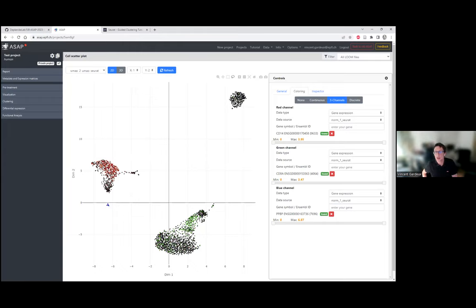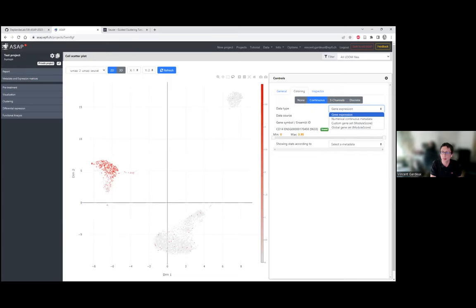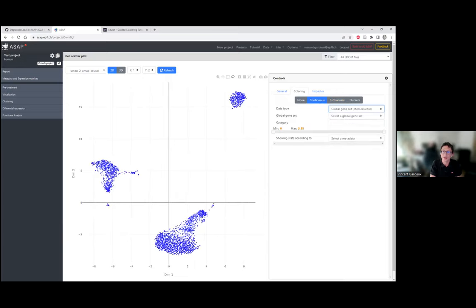And it's also possible actually to use more genes. But then you need to use a feature in Seurat that is called the module score, which is here actually. You can import your own gene set, so you can create a gene set and import it as metadata, as I showed before, and then you can put as many genes as you want. It will create a score that takes the average expression of all the genes that you've entered compared to a background.